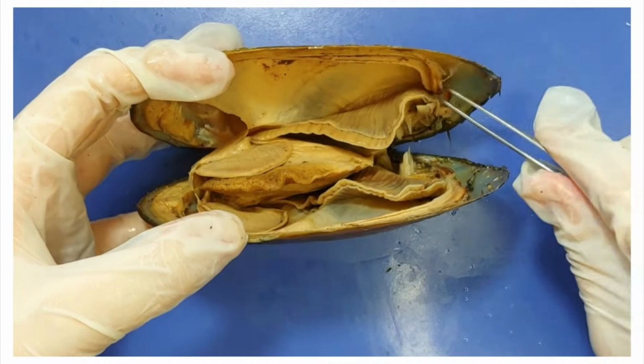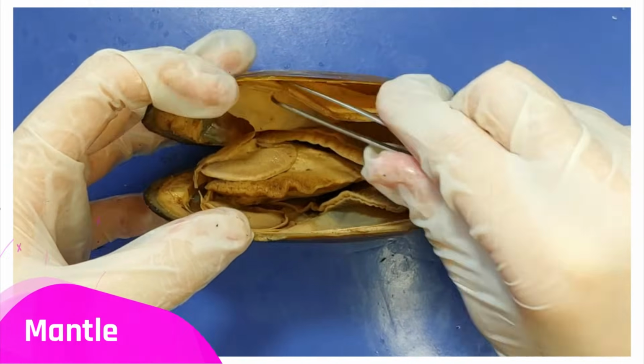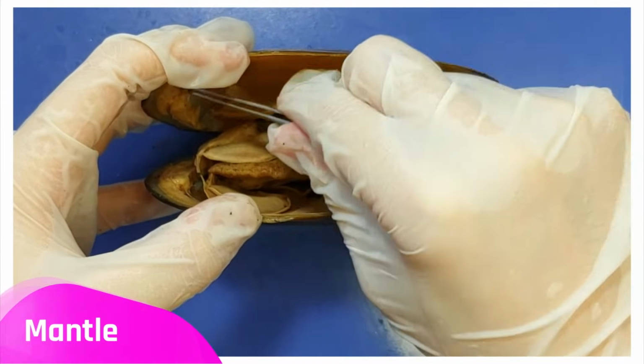This thing that's sticking to the shell, it's called a mantle. It's a sheet of cells that make the shell.